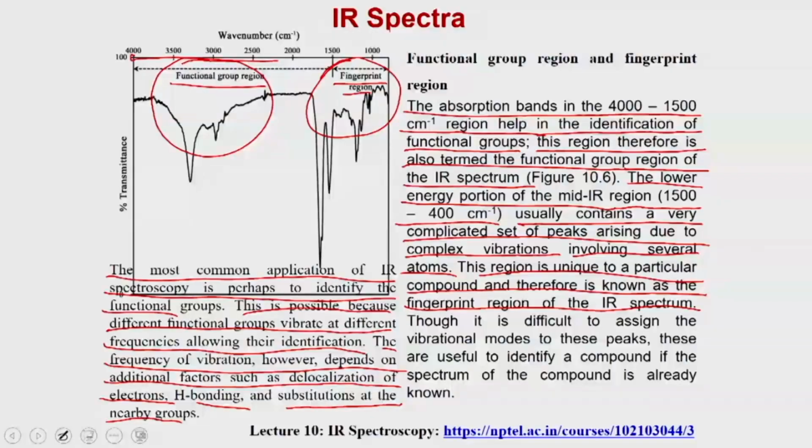Therefore, though it is difficult to assign the vibrational modes to these peaks, they are useful to identify a compound if the spectrum of that compound is already known.